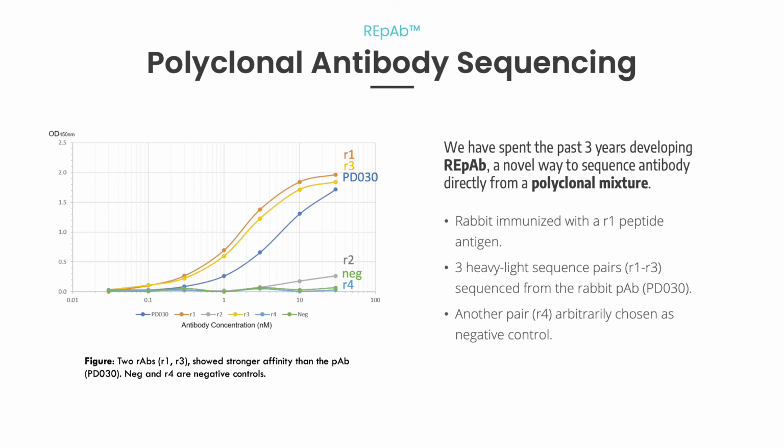So what this has done is it is a repeatable polyclonal sequencing approach that implements these strengths from next generation sequencing combined with this proteomics approach that we've been discussing today to reliably and finally actually define a polyclonal mixture, turn it into a recombinant mixture, to a recombinant sequence, a recombinant antibody that can outperform the polyclonal progenitor.